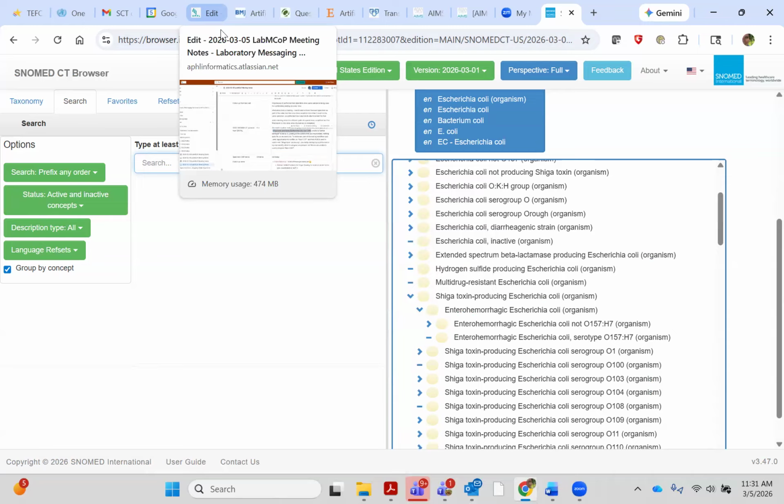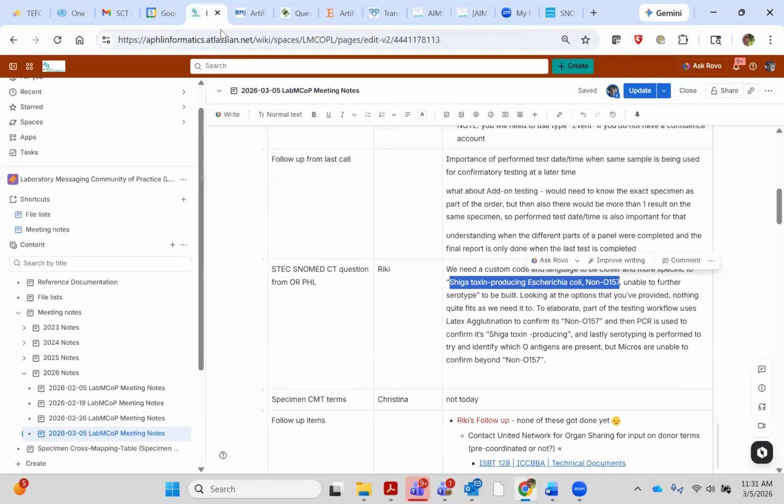For organisms, usually you want to know the single organism with the single code. This gets into lab tests, John, and we've been having a lot of discussion with LOINC, like there's so much thrown into the method axis because there are all these different aspects about the meaning of the lab test.